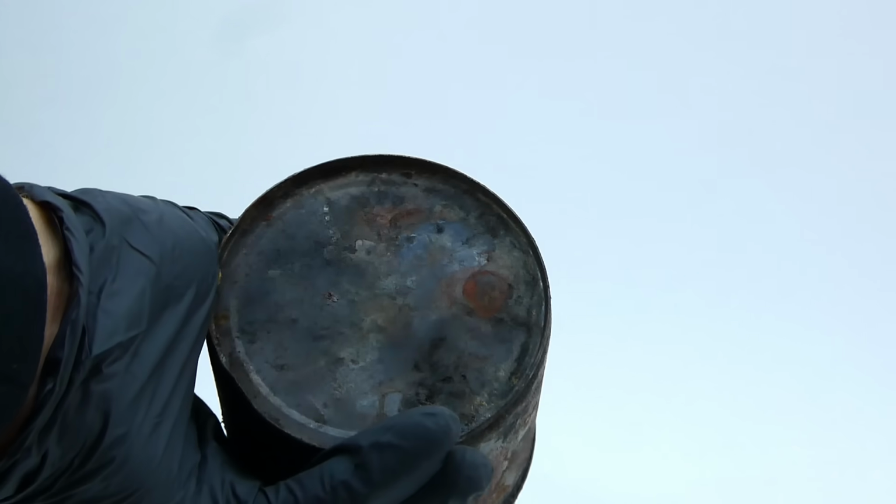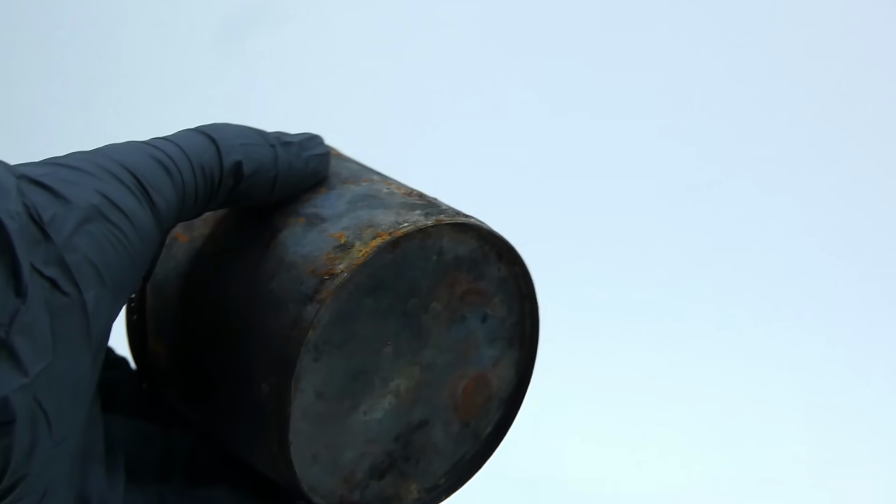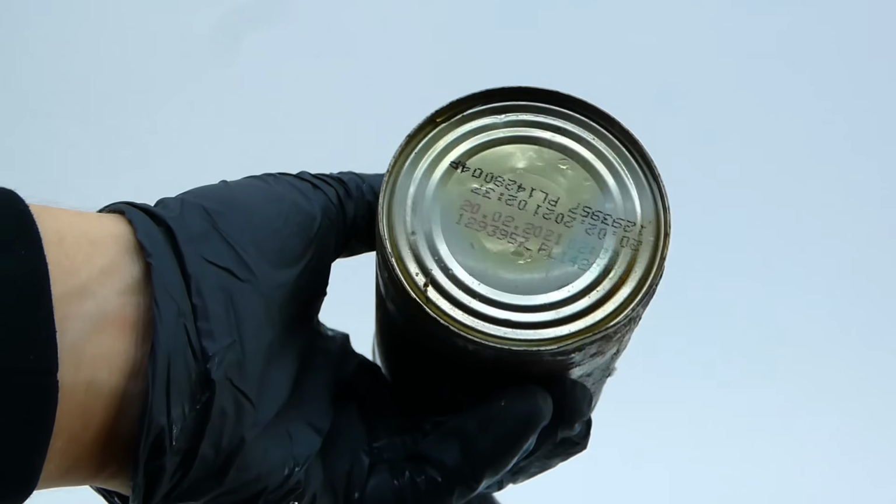I firstly wanted to use this small and rusty steel paint can, but after cleaning it up, I found out that it had the texture of Swiss cheese, and I had to find something else. I found this old cat food can, which will be perfect for this reaction.